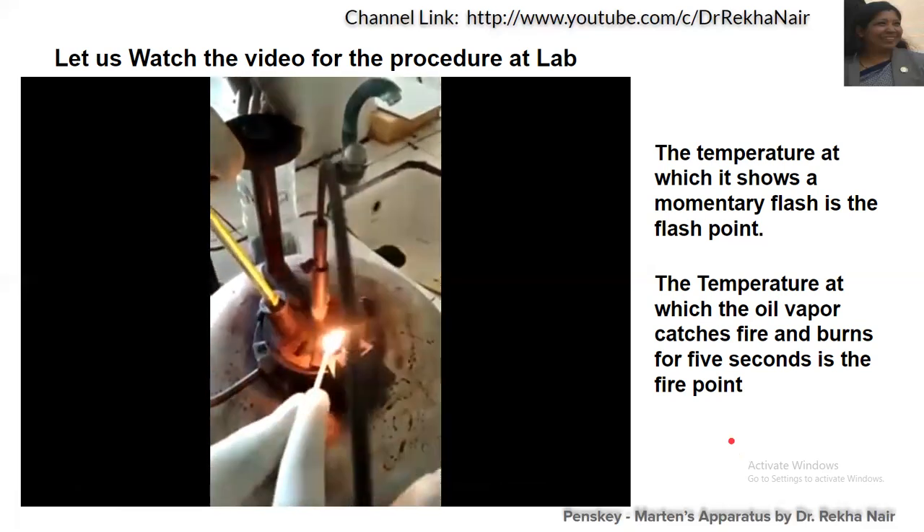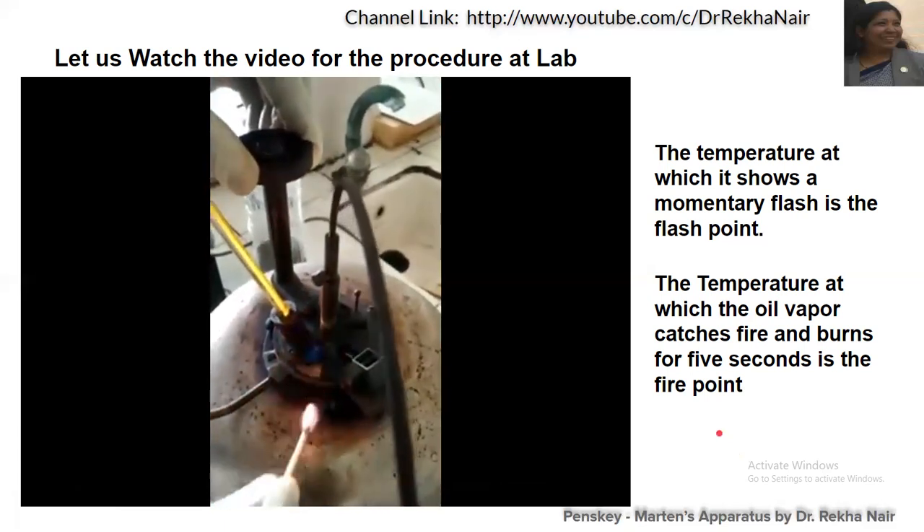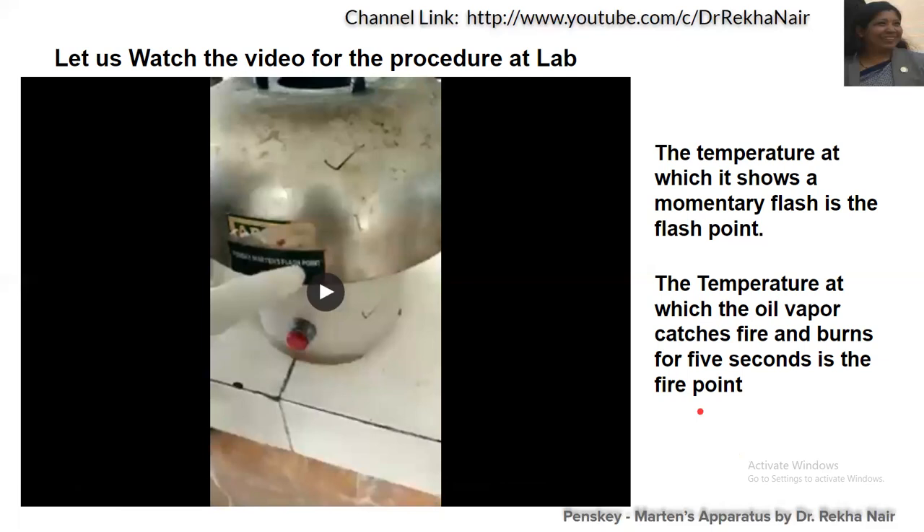At every degree centigrade temperature rise, we need to open the shutter and see whether it catches fire or burns for five seconds. The minimum temperature at which it catches fire and gives a momentary flash is the flashpoint, and if it burns for five seconds, we call it the firepoint.